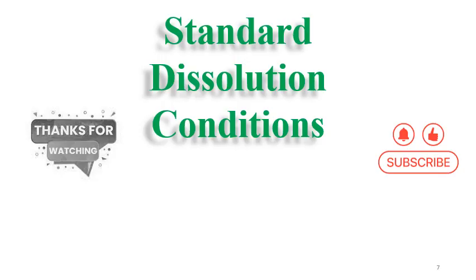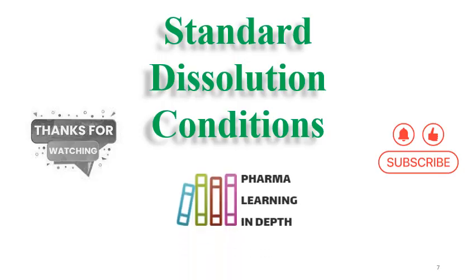So this is regarding the standard dissolution conditions and acceptance criteria for formulations which have an immediate release design and contain highly soluble drug substances. Nowadays, regulatory agencies are asking for justification if you are not following the standard dissolution conditions and the acceptance criteria.